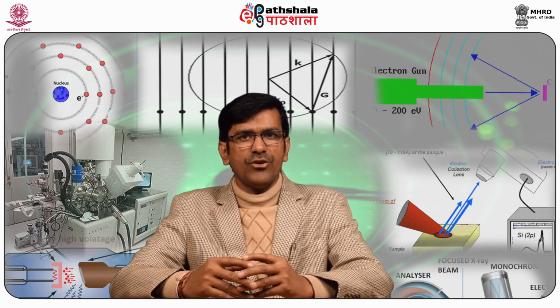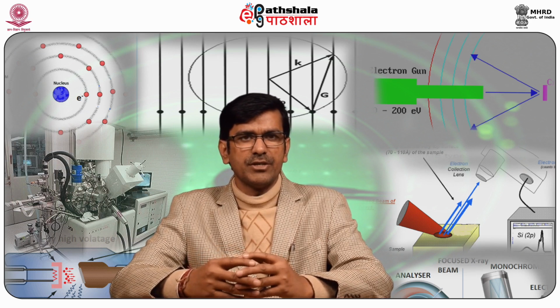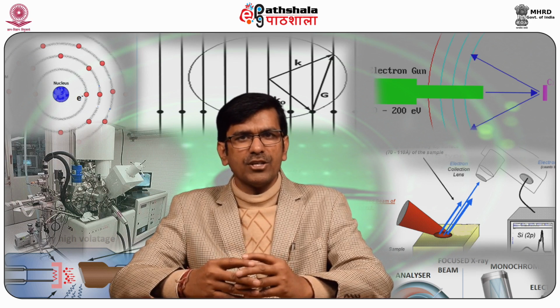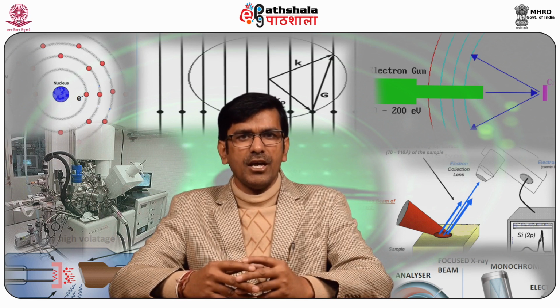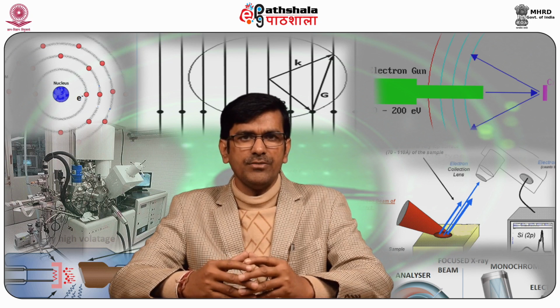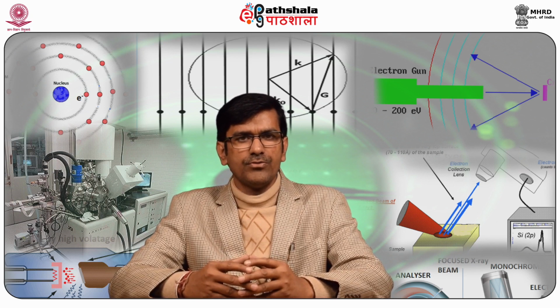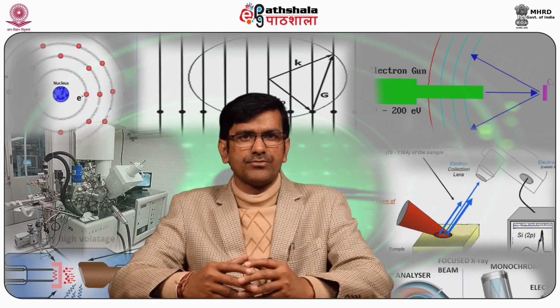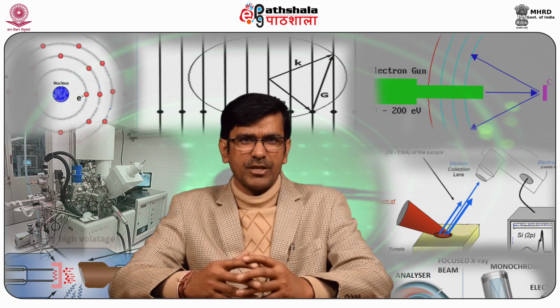Another technique is the addition of electron optics in the instrument. So this comes as an attachment. The third method of improving resolution is specific to XPS and is the addition of an X-ray monochromator to the system. These monochromators eliminate satellite radiation from X-rays and are capable of narrowing the X-ray line width from about 1 electron volt to 0.2 electron volt. The use of monochromatic X-rays is to simplify the spectrum.